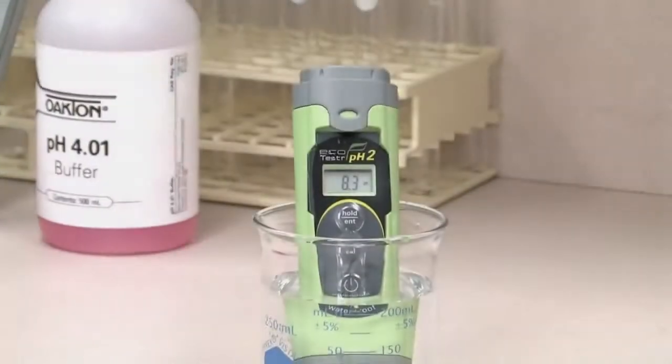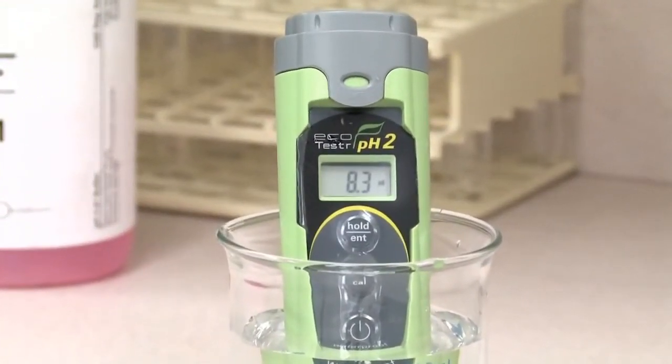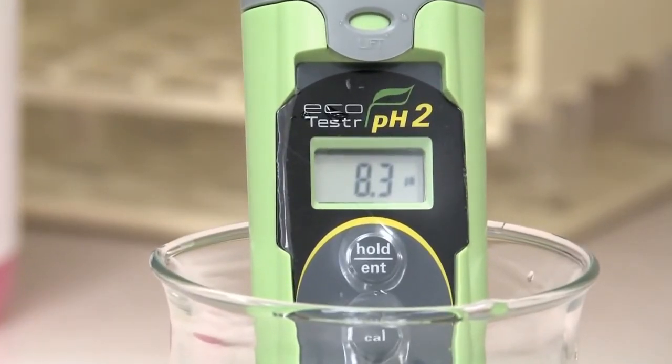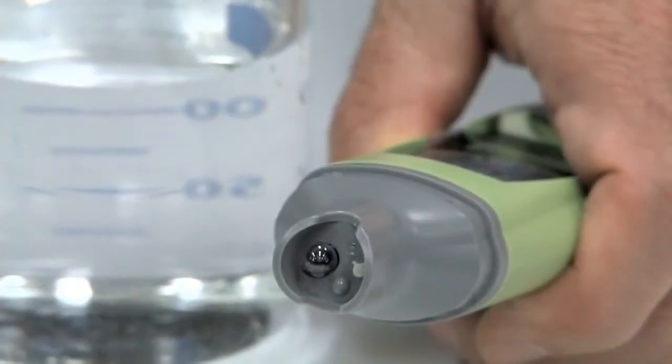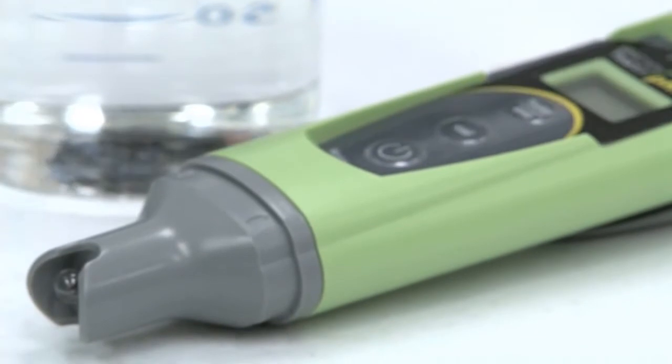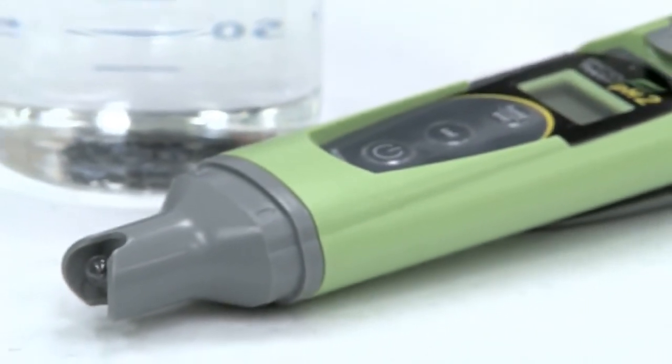The Oakton Waterproof EcoTester pH meters offer key features despite a low price point, such as an easy-to-read display, a single-junction pH electrode that works well for routine sample testing like drinking water, aquarium water, hydroponics, or academics.